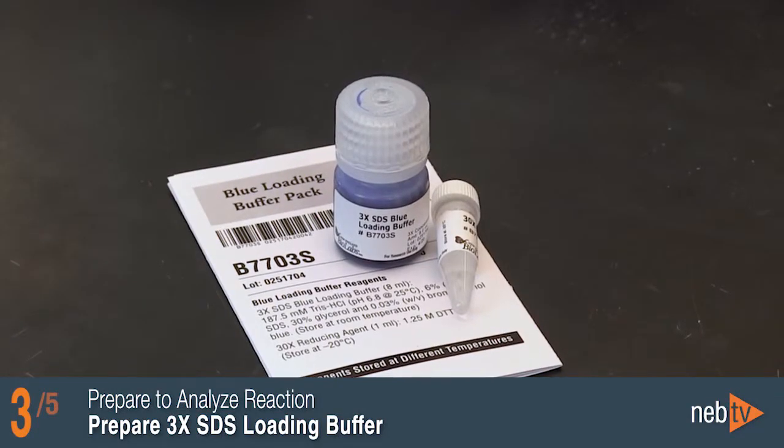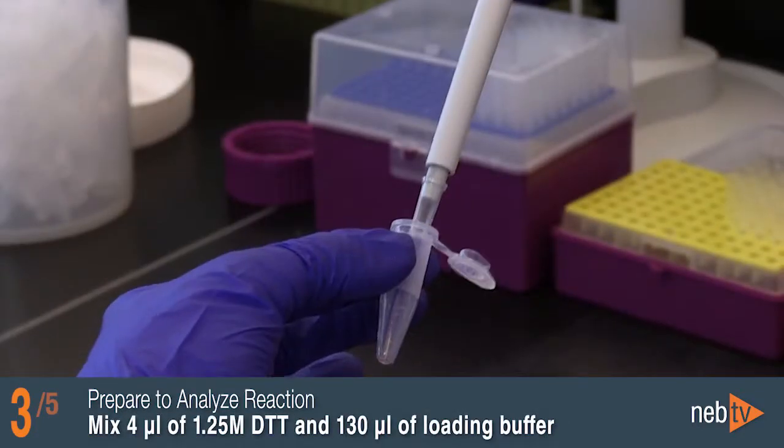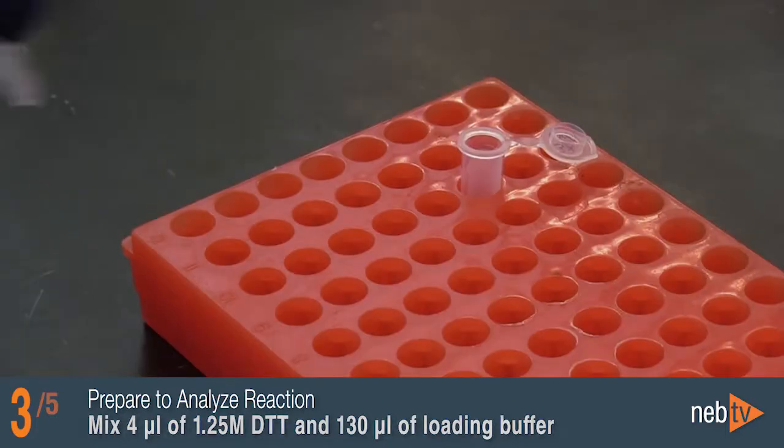While the reaction is running, prepare 3X reducing SDS loading buffer by mixing together 4 microliters of 1.25 molar DTT and 130 microliters of 3X SDS loading buffer.